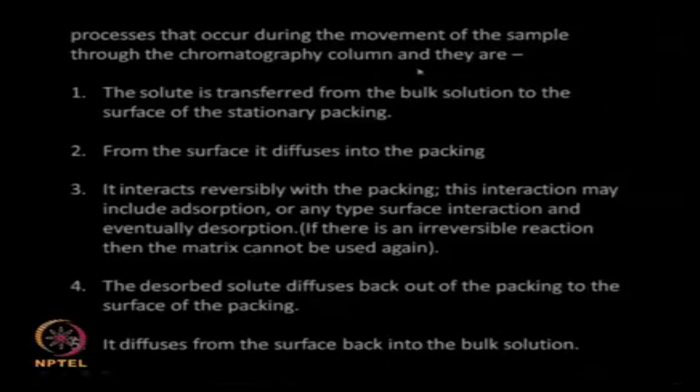So many steps are taking place here. The solute from the bulk solution comes to the surface of the stationary phase, then there is a diffusion of the solute through the stationary phase, then there is a reversible interaction with the stationary phase, then there is a desorption right up to the surface of the packing, and then there is a diffusion from the packing surface into the bulk of the liquid.